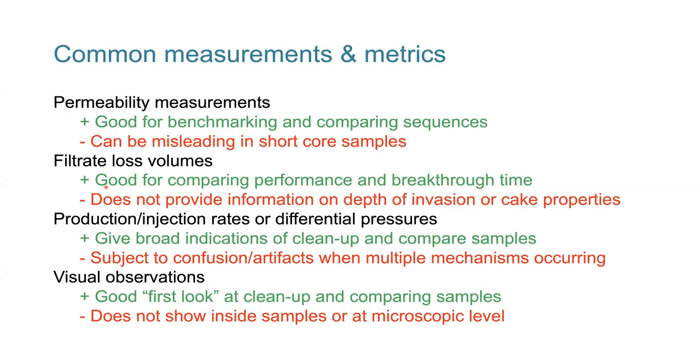Same with the core analysis. So yes, there's a certain amount of prediction of damage you can do from all sorts of well data, but nothing's going to tell you what really happens with your reservoir, with your fluid, with your conditions, other than taking your core, your fluid, your potential drilling completion fluids, and putting them together and seeing what happens. There's no such thing as a reservoir formation damage simulator because there's way too many variables that can be on a bed-to-bed basis.